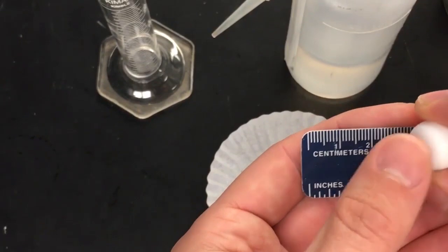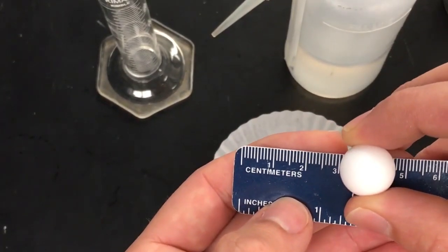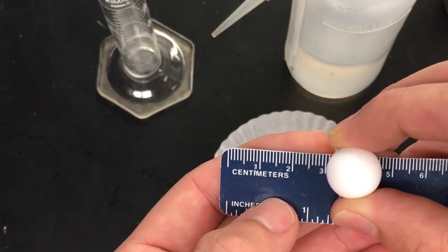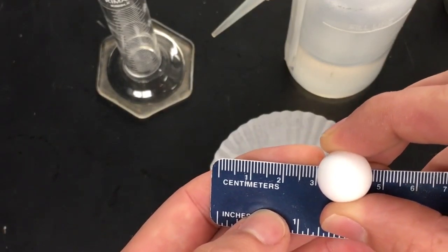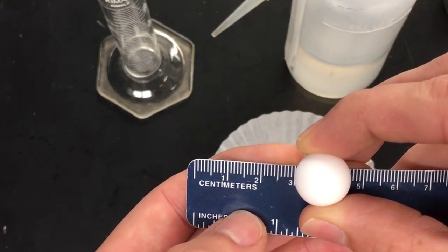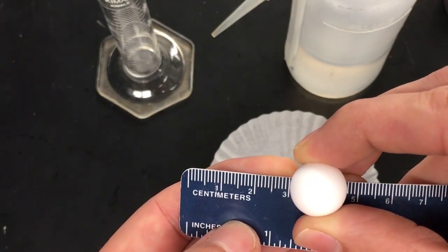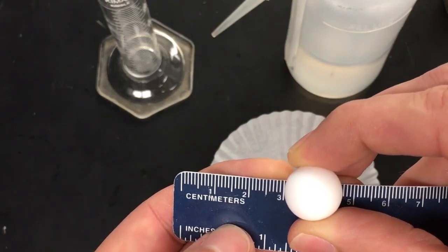Okay, there we go, that's a little better. It's kind of hard to see from your vantage point because I'm holding it. But see how one edge is right on the 3. At what point does the sphere eclipse on the other side? Well, it looks to me like it goes to almost exactly 3 dashes, 1, 2, 3 dashes before the 5.